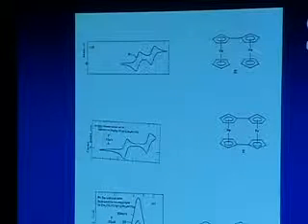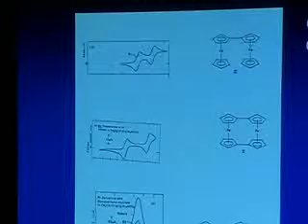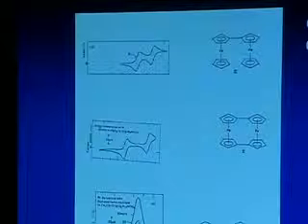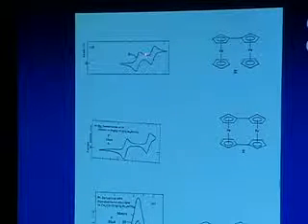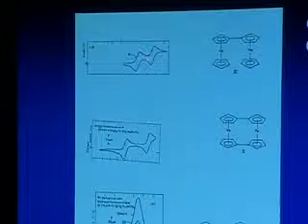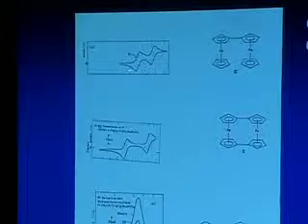That's pretty easy to do when they're this far apart. That is, the Cottrellian current has fallen off quite a bit, and so I can guess and come up with a reasonable answer, or better yet, I could do the strip chart trick and come up with a great answer. That is, run one cyclic voltammogram that goes all the way through this thing, a second one that stops here, and then turn on my time axis and go out and get it. So I need to do it for all three of these peaks, in other words, a baseline correction.